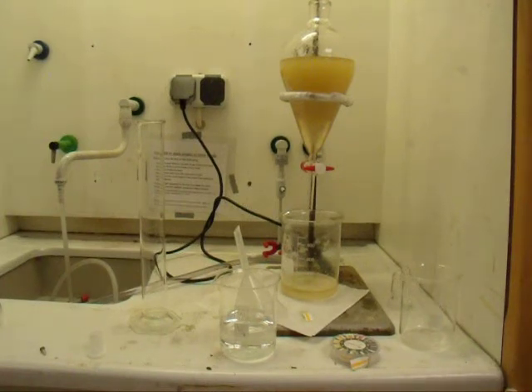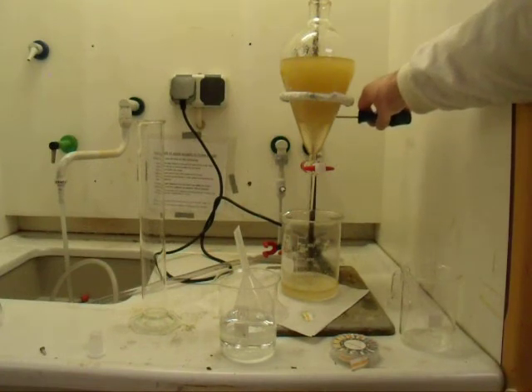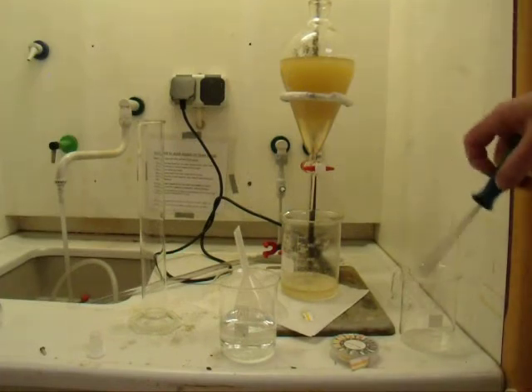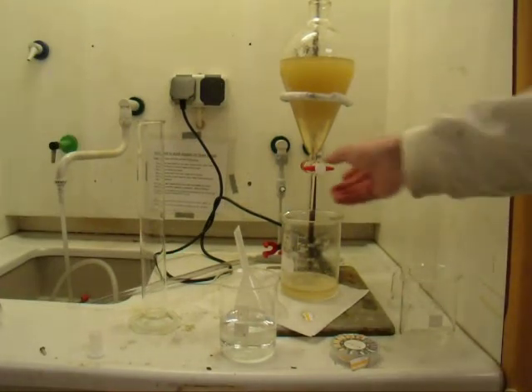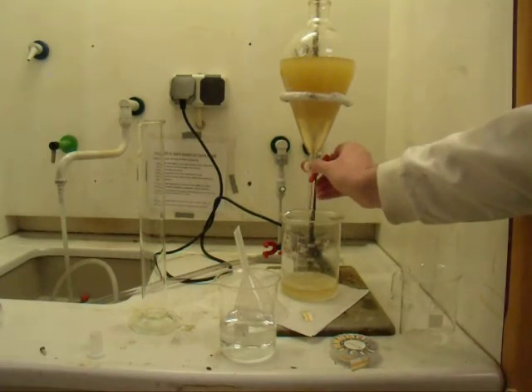As I said before, we have a clear layer at the bottom, a cloudy interface with a moderately cloudy bit at the top. It's hard to demonstrate because it's so thick, but we can demonstrate that we can pour off more of the clear layer at the bottom.